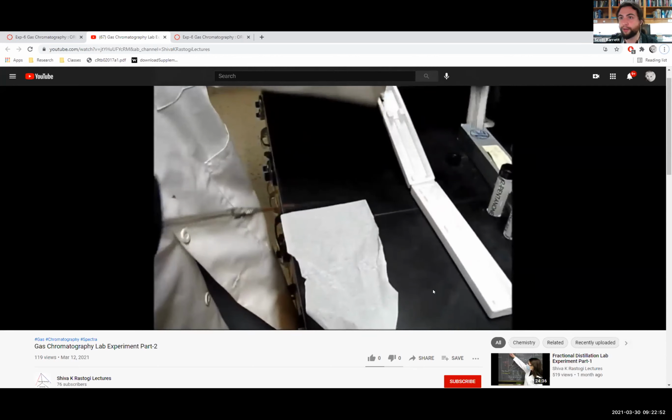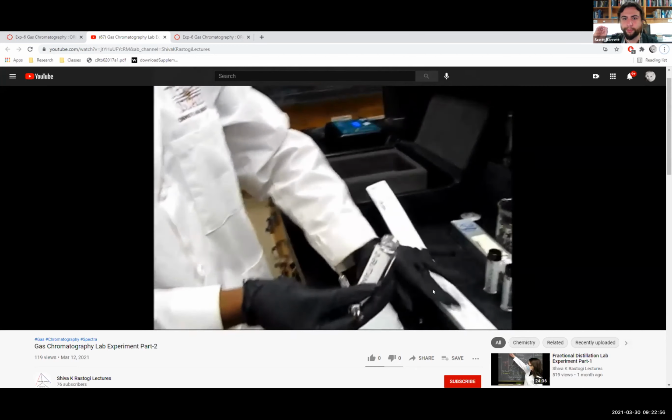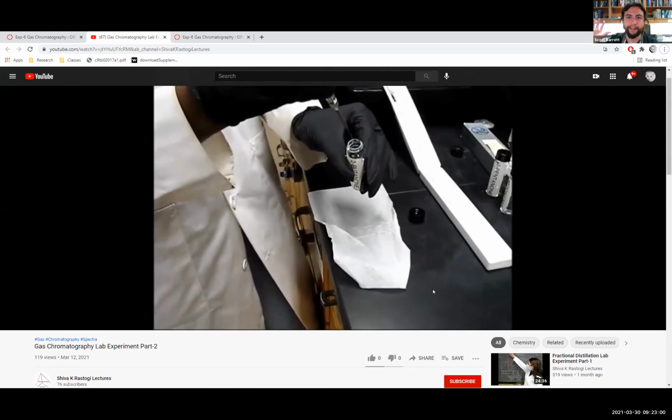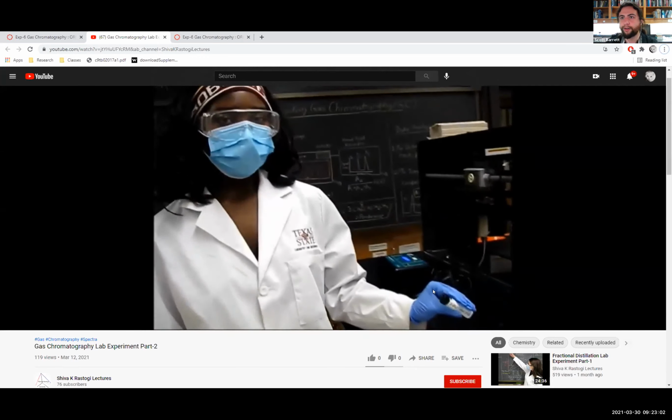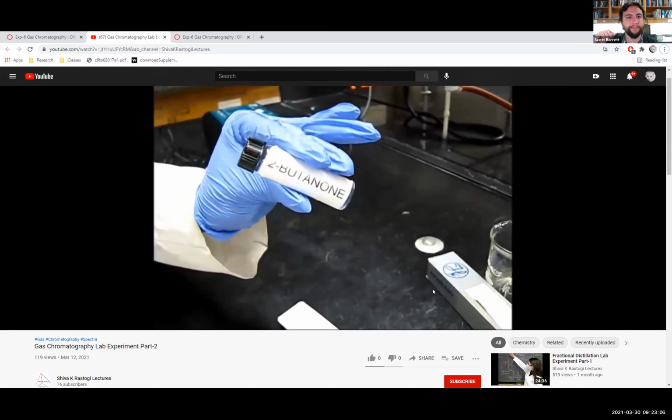And acetone's great because it's amphiphilic. It's both polar and nonpolar, so it'll pull both water and hydrocarbons out of given glassware. That's why we love to use acetone in lab.